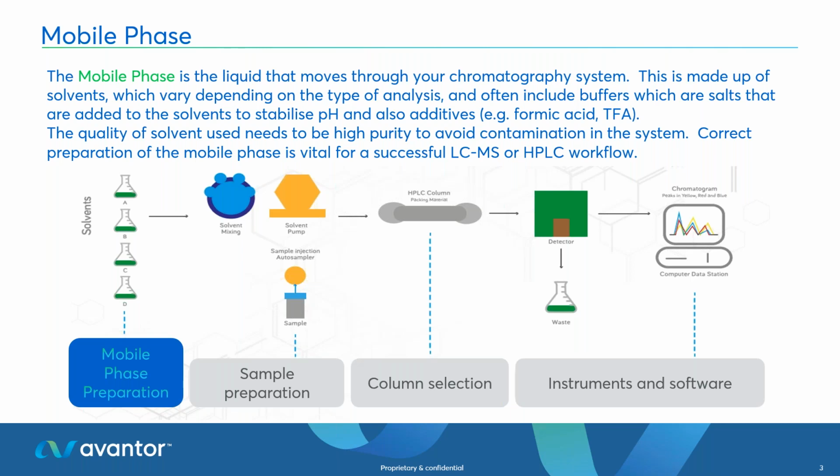So whether you're coming from a method development background or you're looking at this as QC, QA, then I think there's something in here that should be relevant to everyone. So we're going to go back to basics, as it says in the title. We're going to start with what are our solvents, or what am I talking about when I'm mentioning mobile phase? How does it fit into the separation? And then dive a little bit deeper into the choices we make and why potentially we choose one solvent over another solvent.